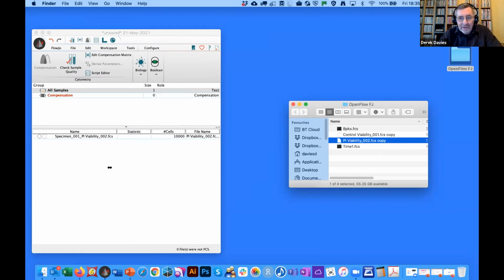So this is a real life example. It's from one of the practical courses that I've run over the past few years. So it's not perfect, and I'll show you why it's not perfect in a second. But let's think about how we would analyze this data.